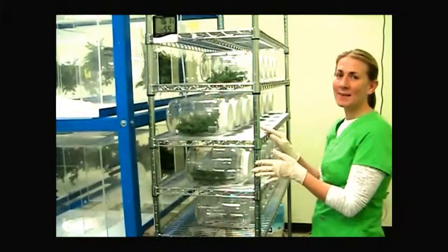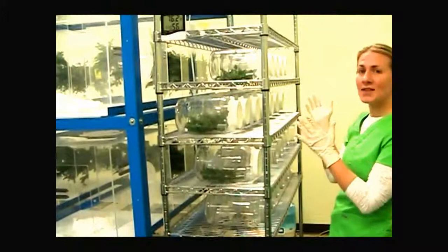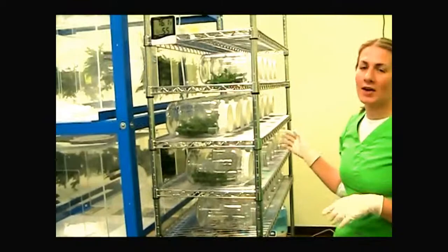Hi and welcome to Tree Savers. My name is Jamie Longo and I'm going to give you a tour of our lab. This is the second in a two-part series where we're showing you the new Tree Savers lab. Today we're going to focus on the jars because we actually have the beetles in stock now. There are two jars missing and I'm going to take you in the other room and show you where they are and how we process them.